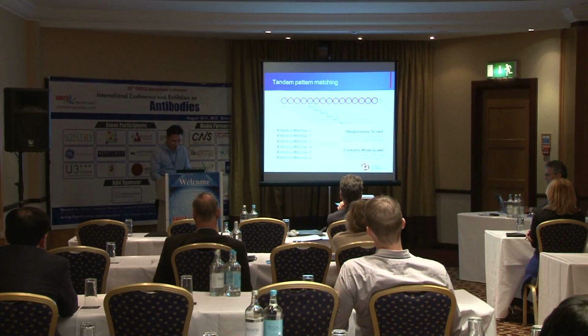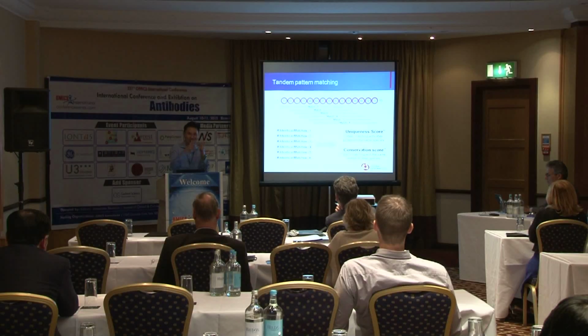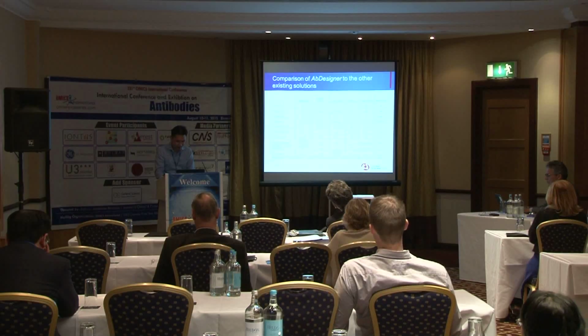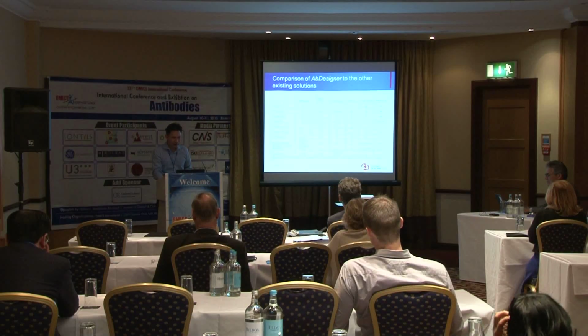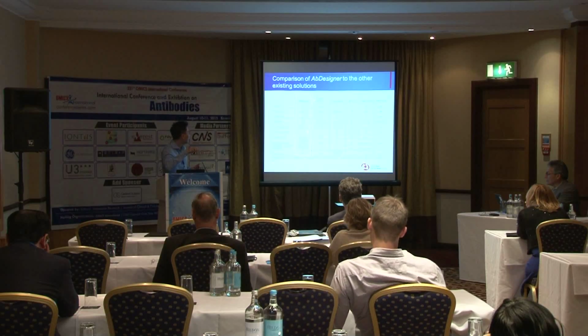Then you get all the matches. Yep. So just easy pattern matching. I'm a biologist, so I'm not looking for complicated calculation, just something easy, the way most people will look at it. And then we compare with other tools that are available.